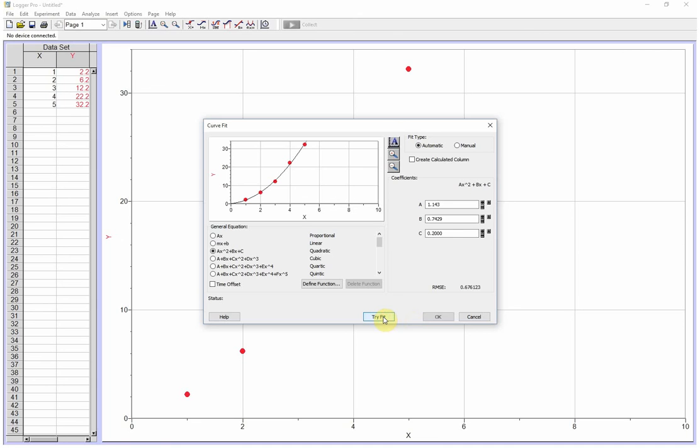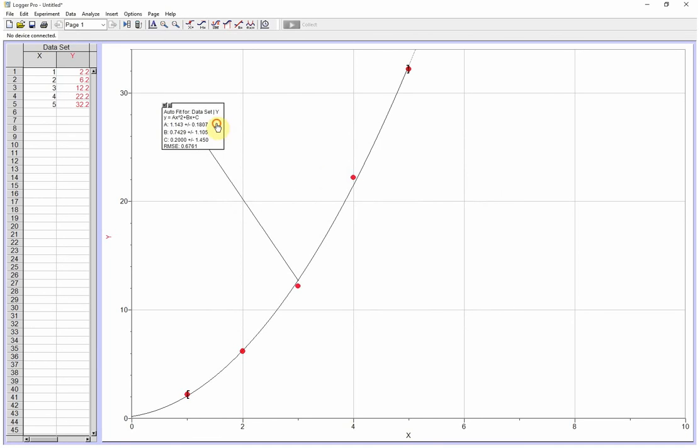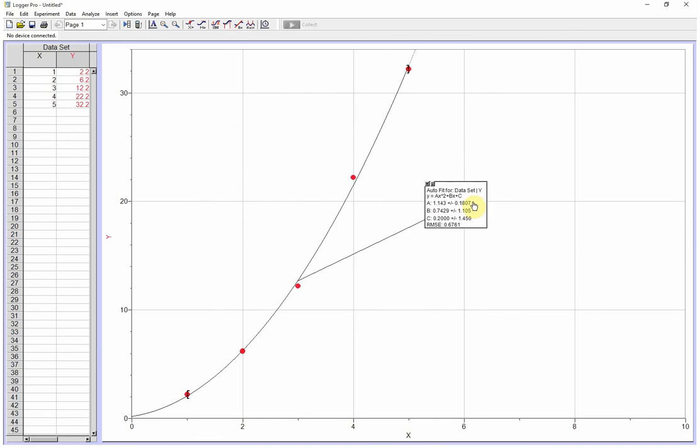If we do tri fit, it's going to give us a line that fits pretty well. And then we just click OK, and there you have it.